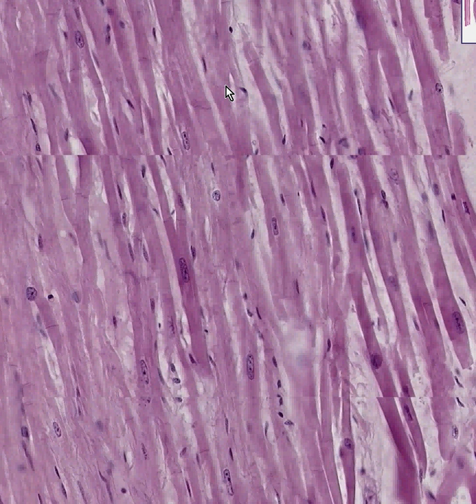So cardiac muscle is also striated, not as nicely striated as skeletal muscle, but it has the nuclei in the middle of the fiber. It has intercalated discs. The fibers branch to connect with adjacent fibers because the method of contraction is not linear, it's in multiple dimensions. And last but not least, the fiber is not quite as thick as the skeletal voluntary striated fiber. They're a little bit smaller.